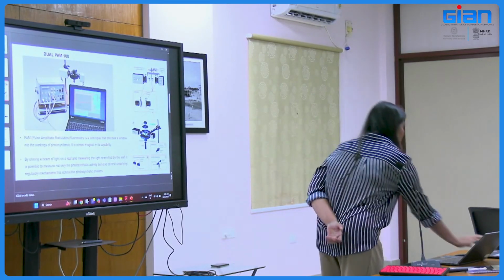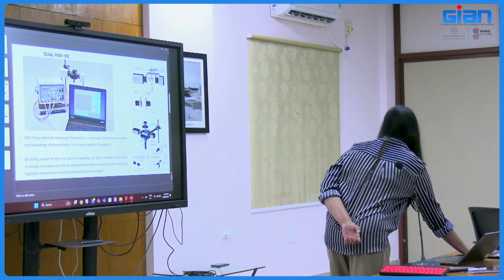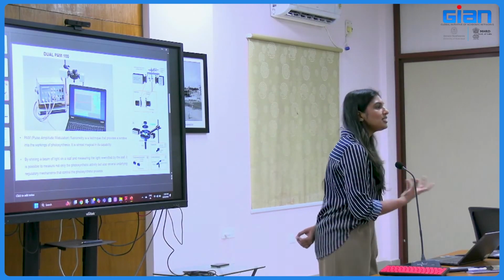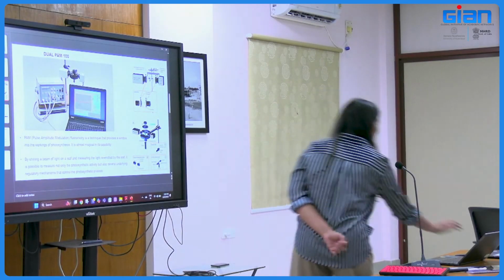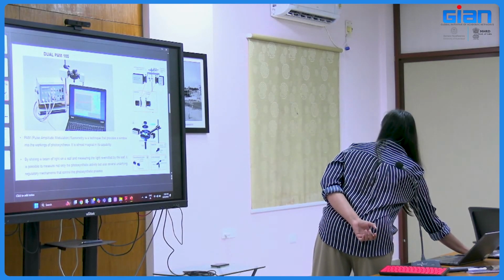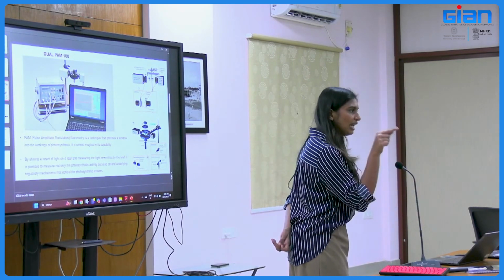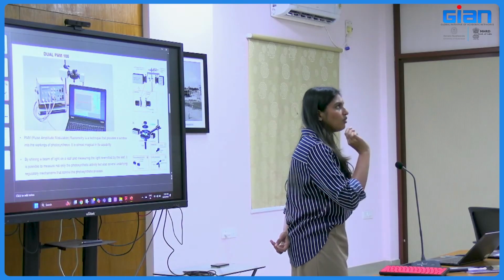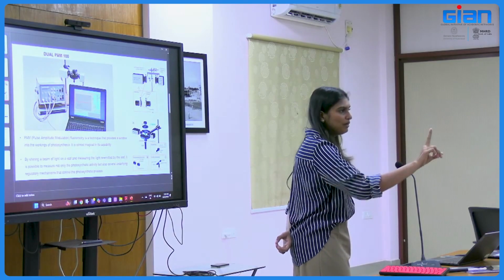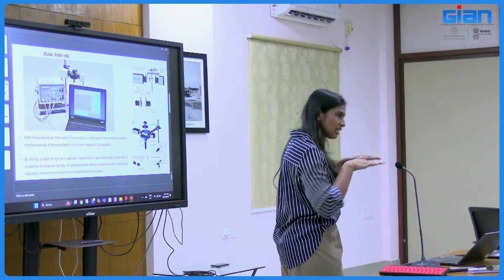But when it comes to this part, there is a signal processor. This signal processor will only take the modulated light signal coming from here. Even though we are giving an actinic light at one point, for 30 seconds, the background measuring light is going on.